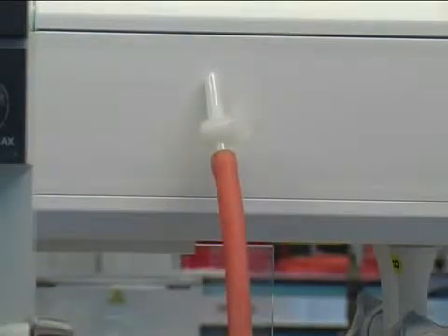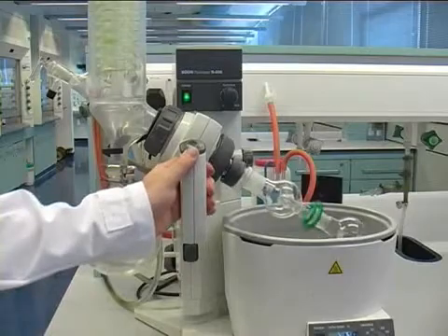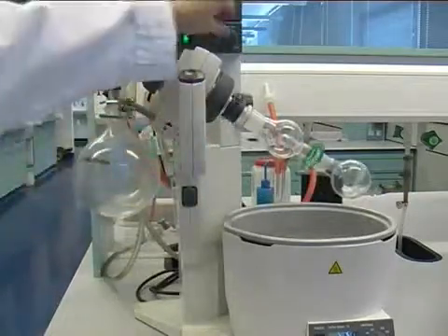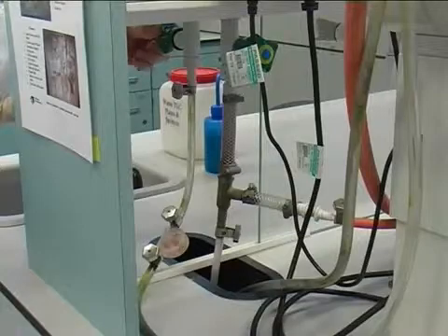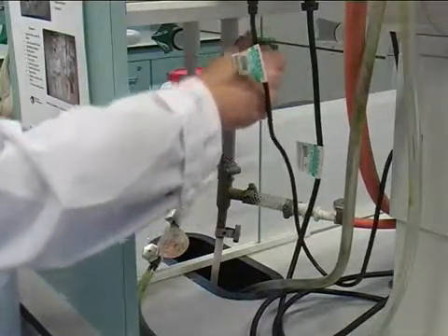And once those two connections are open, you take out your rotating round bottom flask of the water bath, switch off the rotation. Remember also to switch off the heating bath and to switch off the water coolant and to switch off the water pump.